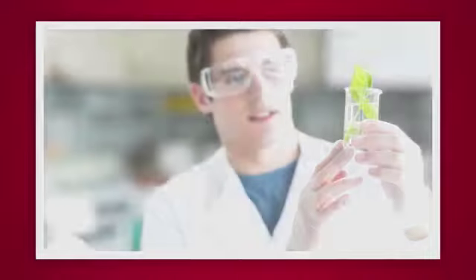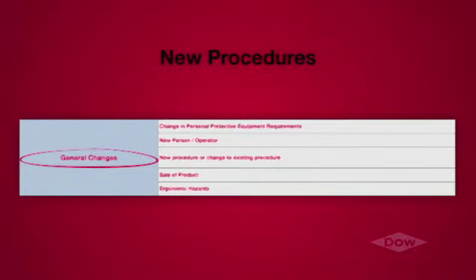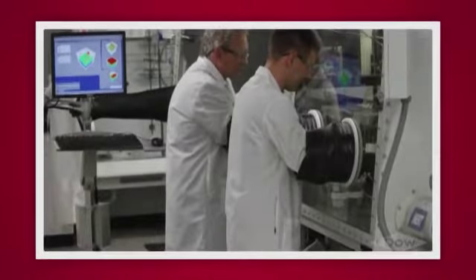So as you train new people, use your procedure document. Have them follow the document while you show them the task. If they don't see a specific task being done as written, discuss why you are doing it differently from the procedure. New procedures developed. Input and perspective from experts about your new procedure can be invaluable.